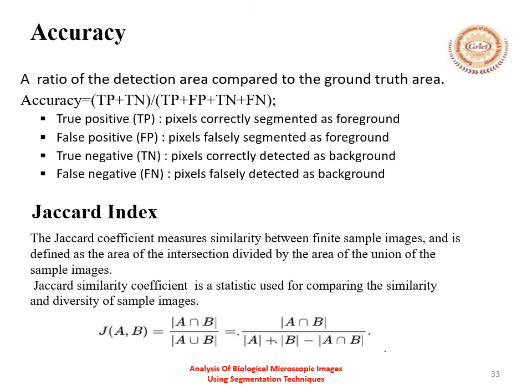The metrics used to compare all the segmentation techniques are accuracy and the Jaccard index. Using these two metrics, we can compare the segmentation techniques and choose the best out of them.